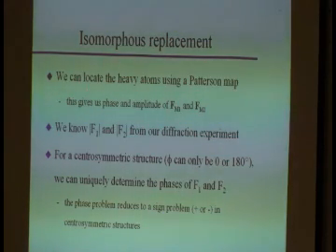So we can calculate these completely, and we know these values, the structure factor magnitudes, from our experiment, because that's what we measured, right? Or we measured intensities, but we take the square root, we get these. Now, if you should be lucky and have a centrosymmetric structure, and of course that doesn't happen all the time with proteins because they're usually chiral, but just for simplicity, let's look at a centrosymmetric structure.